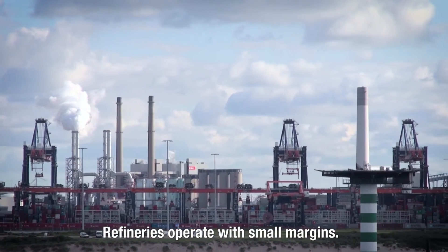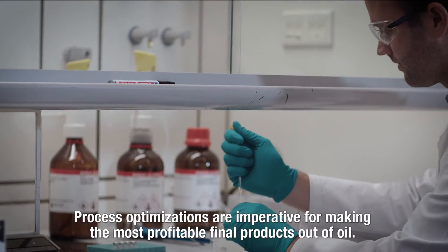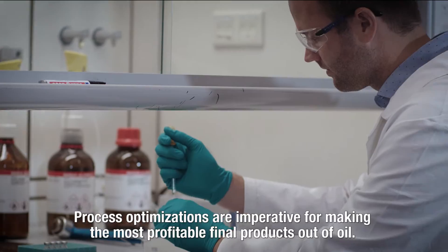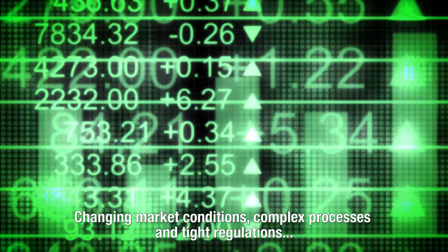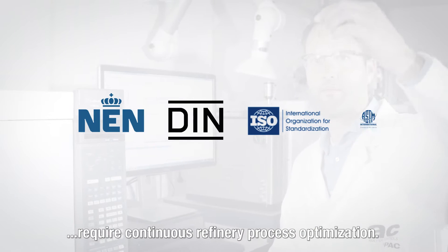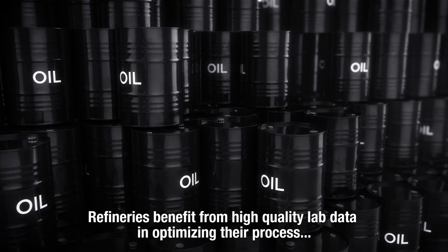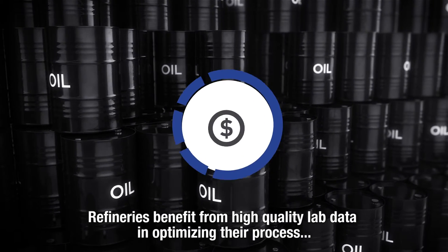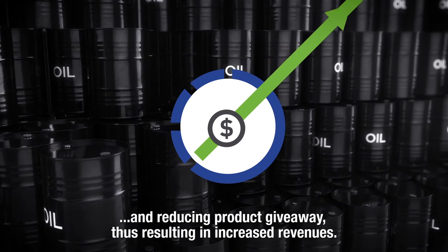Refineries operate with small margins. Process optimizations are imperative for making the most profitable final products out of oil. Changing market conditions, complex processes, and tight regulations require continuous refinery process optimization. Refineries benefit from high-quality lab data in optimizing their process and reducing product giveaway, thus resulting in increased revenues.